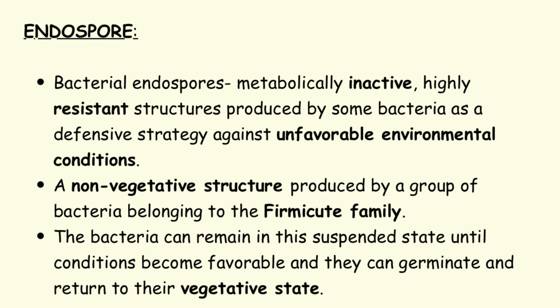So the endospore is a non-vegetative structure produced by a group of bacteria belonging to the Firmicutes. Why are endospores considered a non-vegetative structure? It is because they are not actively involved in the metabolic activities of the bacterial cell. And we also said they are inactive, highly resistant structures, right? They are resistant to high temperature, radiation, and chemicals like disinfectants and acids. The bacteria can remain in a suspended state until conditions become favorable, and when conditions are favorable, they can germinate and return to their vegetative state.